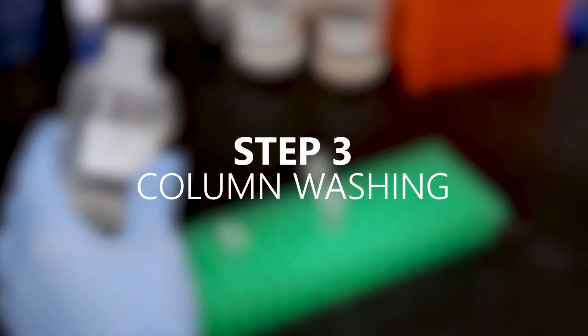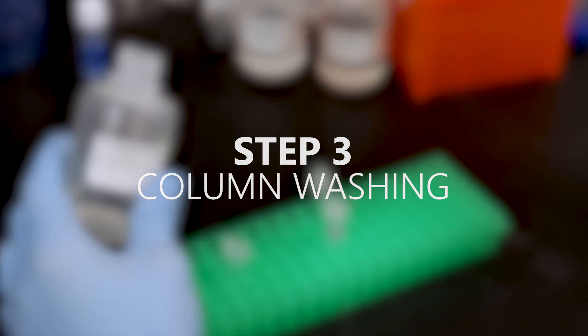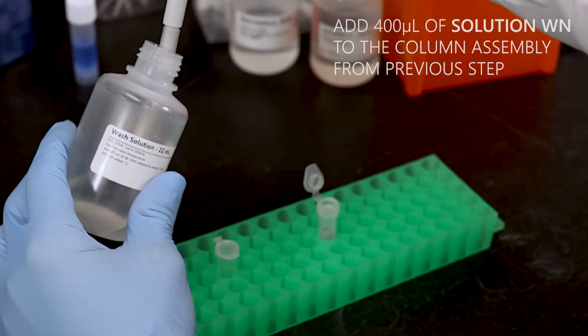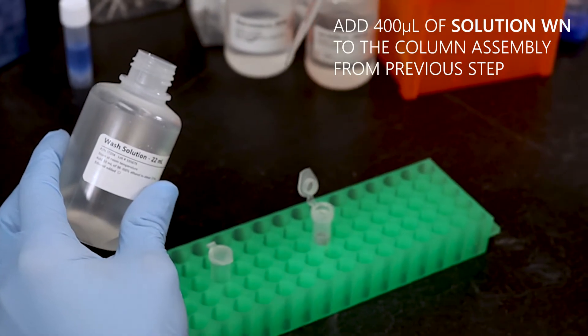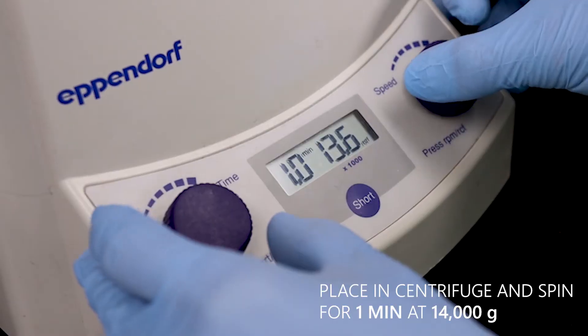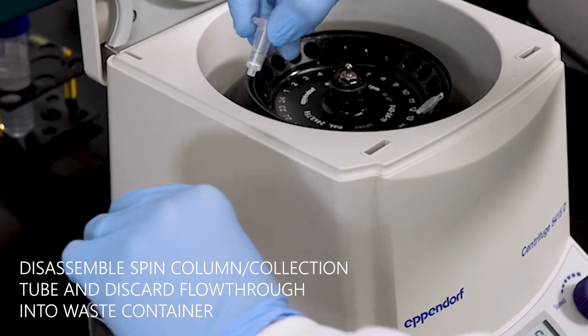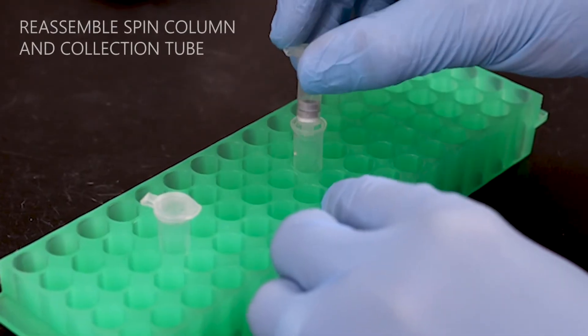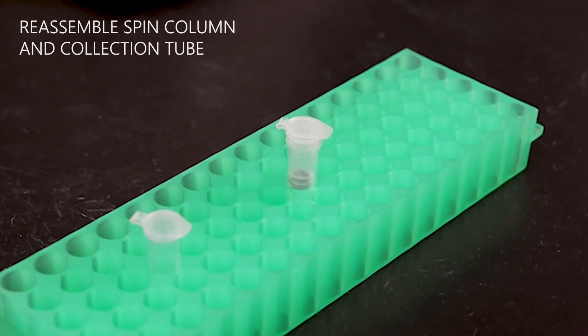Step 3. Column Washing. Add 400 microliters of Solution WN to the column assembly. Then centrifuge for 1 minute at 14,000 G. Discard the flow through into a waste container. Reassemble the spin column and collection tube.